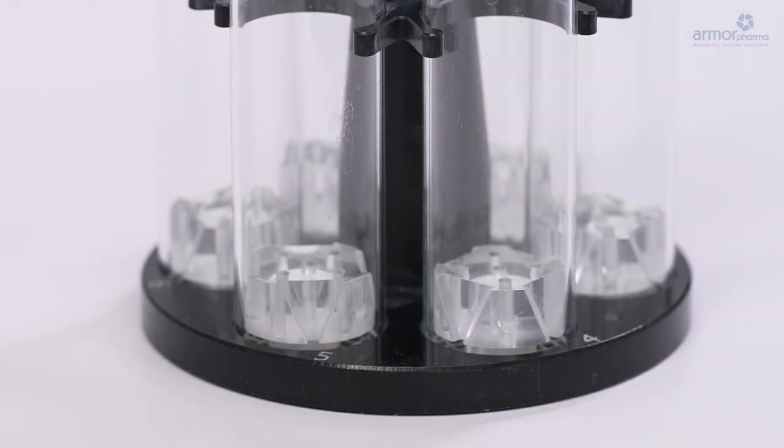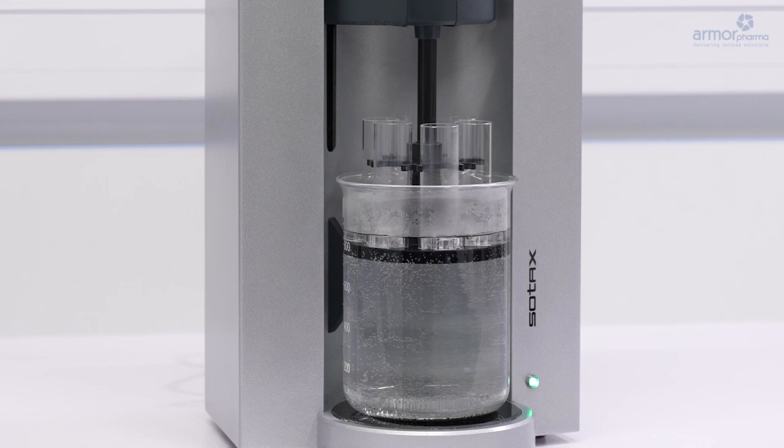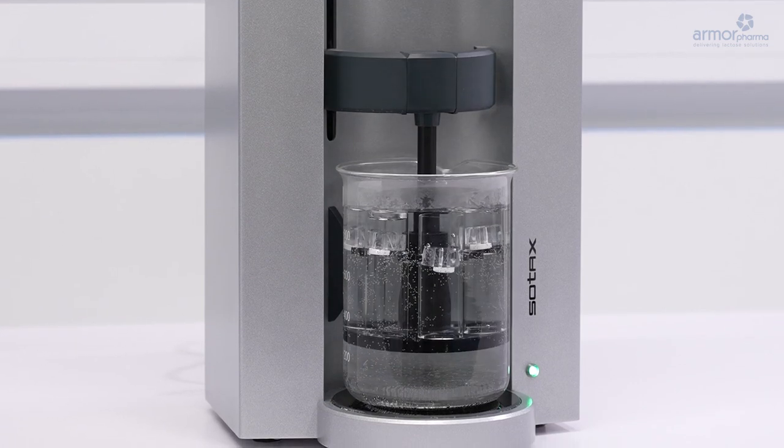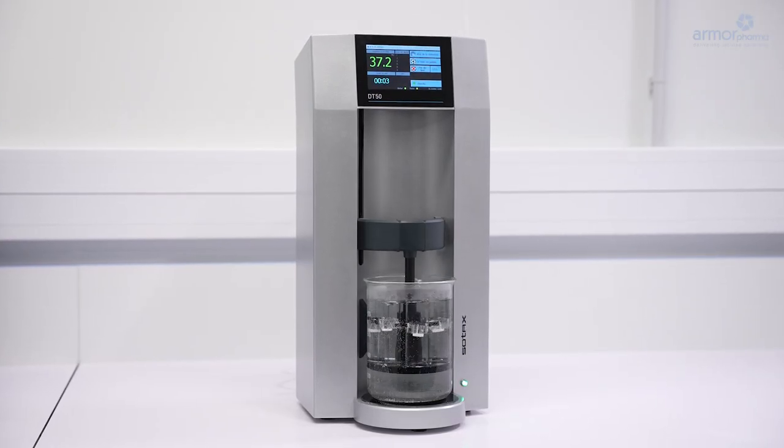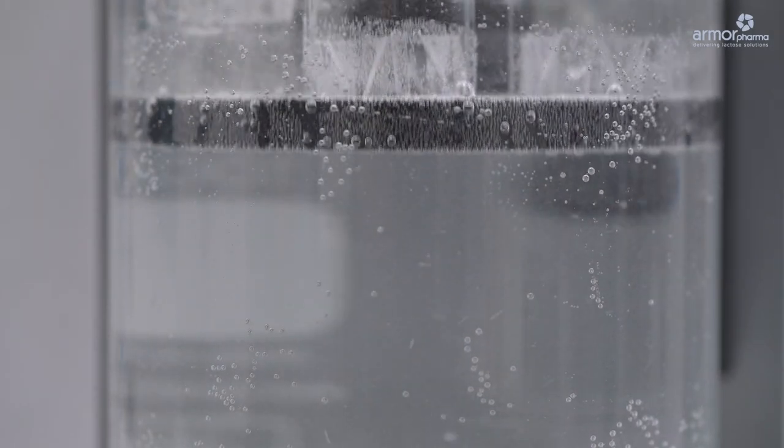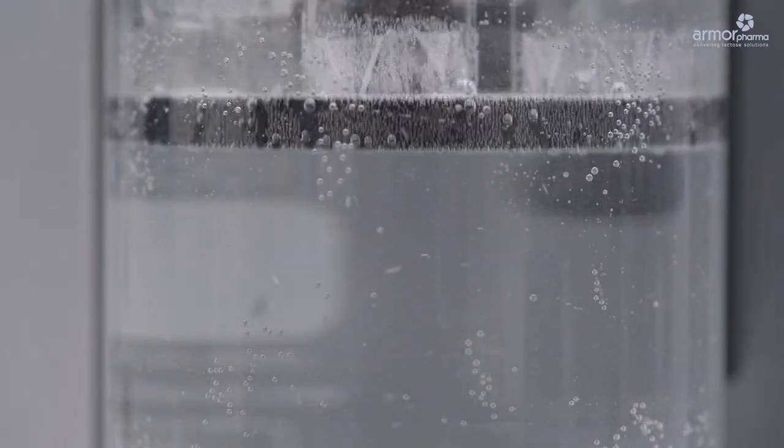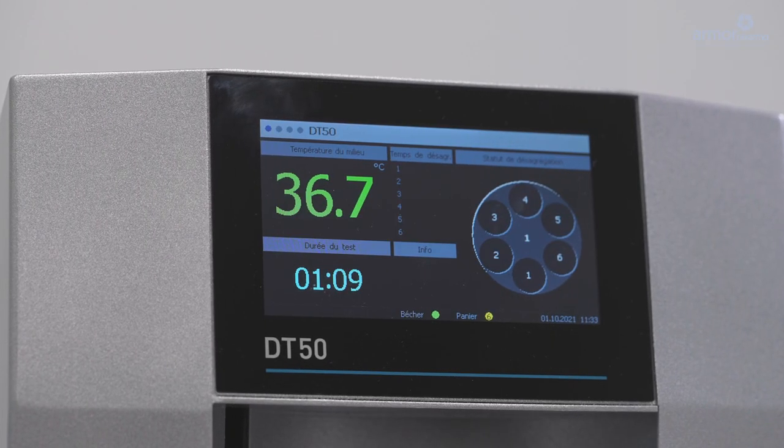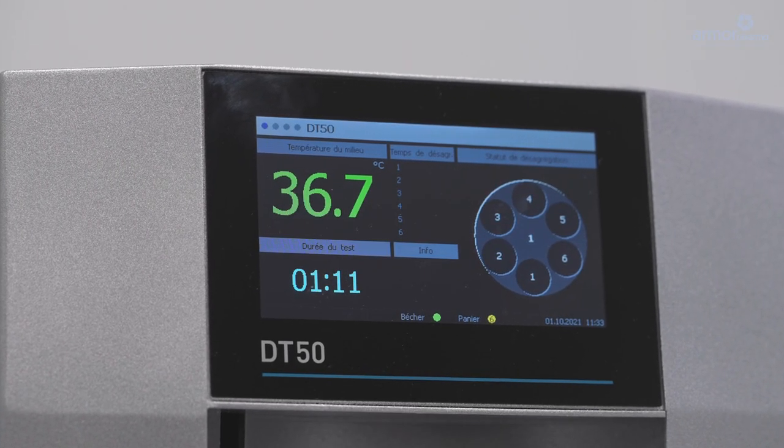Discs are placed on top of each. It is then raised and lowered at a constant frequency into a one liter beaker of water or acid at 37 degrees Celsius plus minus 2 degrees, which is like the human body temperature. The time is recorded when the dosage units have completely disintegrated.